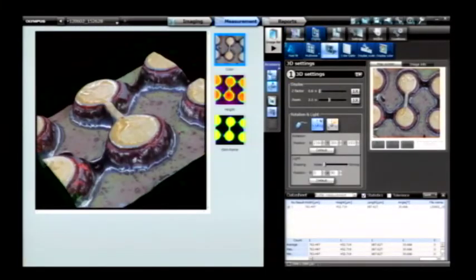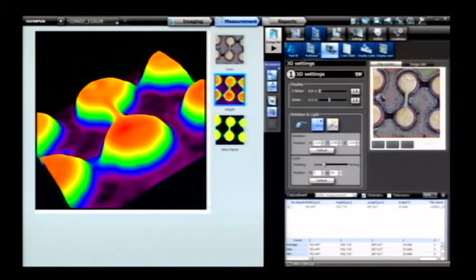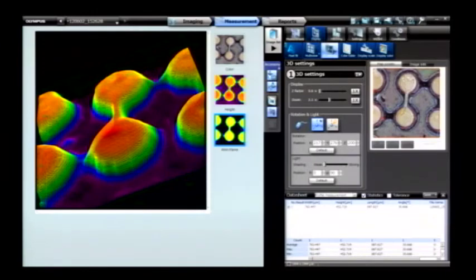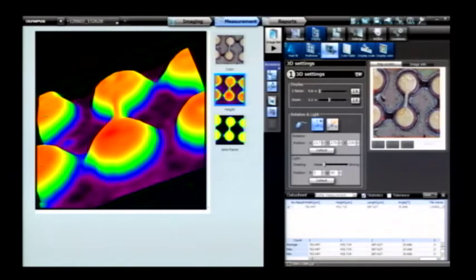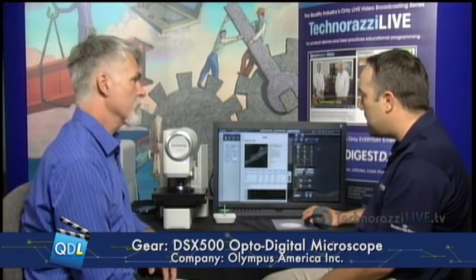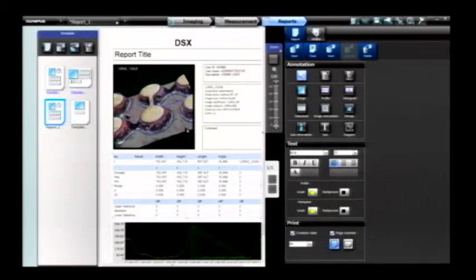All this information gets exported. Going back to our profile and 3D image, we can show the raw color image, height data in a height image, or even a wireframe view to see where curvatures happen on your sample surface. Once you've taken all your measurements and gathered your images, a single button push creates your reports. A customizable template generates a report showing your line profile and actual 3D image that can be rotated live on screen, then exported to Microsoft Word or PDF format.